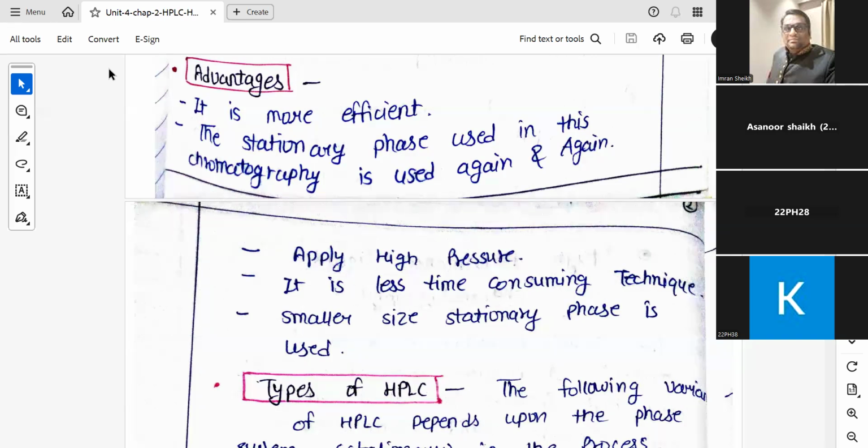So you have bypassed all the processes. So one matter of concern in HPLC is purging. Once the first run happens, do the purging.